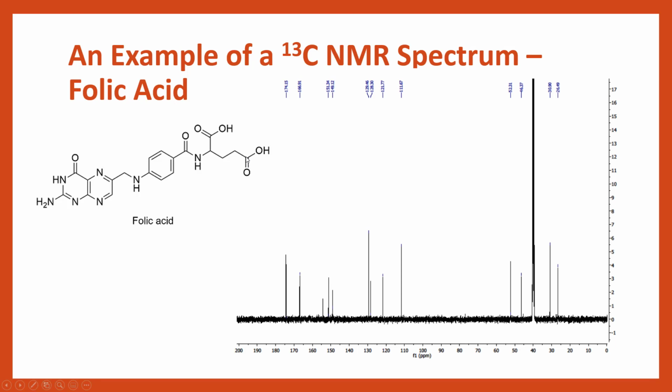So if you had a carbon-13 spectrum, you'd have the structure that you think it is. If you're doing chemical synthesis, you'd have the structure of the molecule you hope you've made, and you'd literally go through and identify every carbon. Just for your knowledge of chemical structures, this is a skeletal structure, another way to draw a chemical structure. Every corner is a carbon, so we literally go through and number and label all of these carbons.